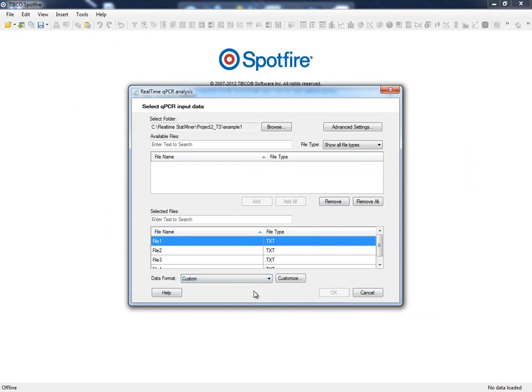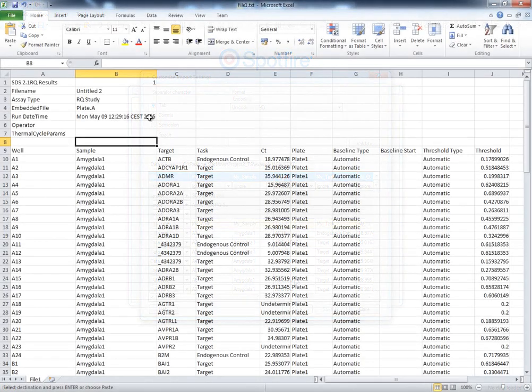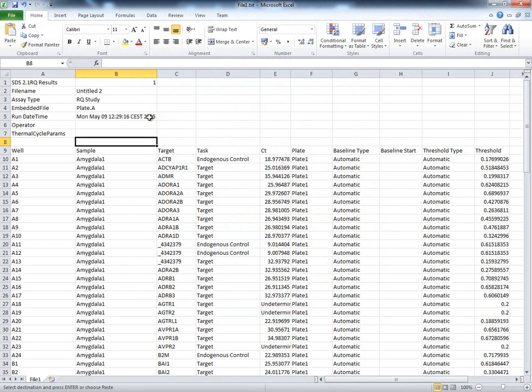To do that, we only need to select the custom mode and open the Customize Import Settings tool. Before exploring this tool further, let's quickly describe the information and the format required by StatMiner to run an analysis.